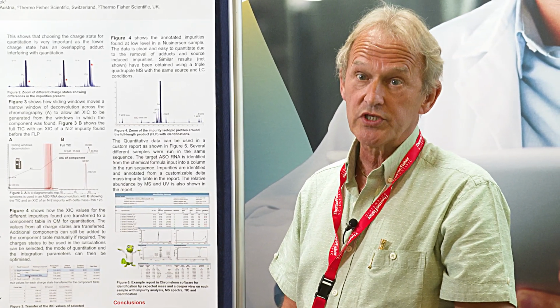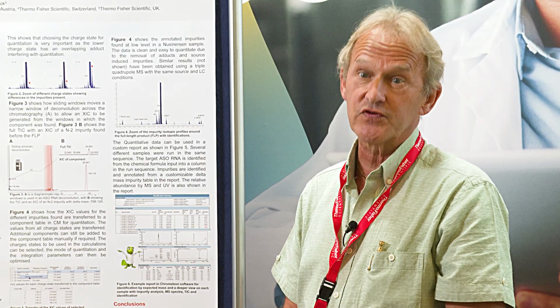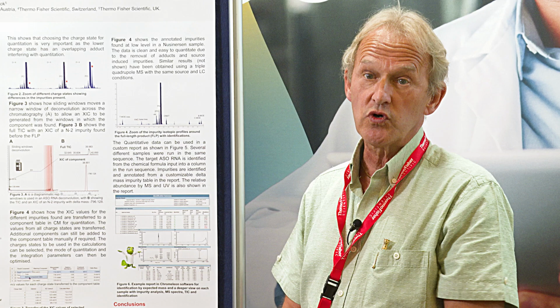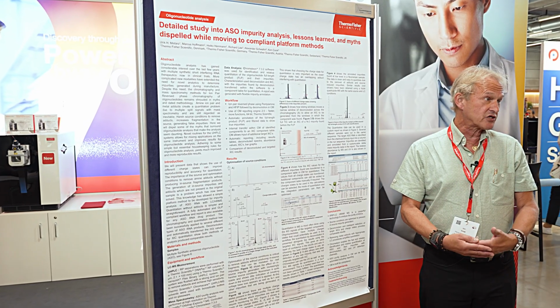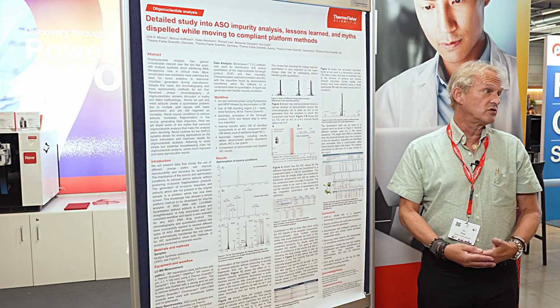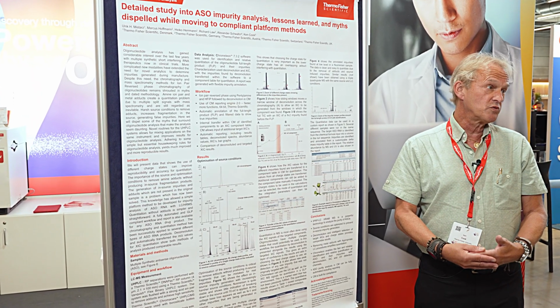The other thing that we did learn was that it's not easy to keep an LC clean enough to do this analysis. So we have protocols to keep the LC clean so we don't get a lot of these adducts that are plaguing oligonucleotide analysis, and that makes the analysis and quantitation much more simple.